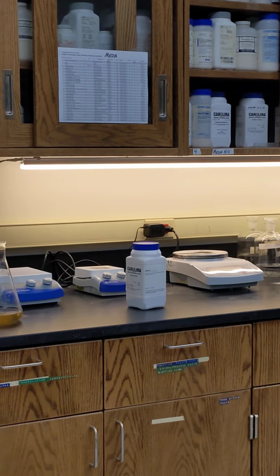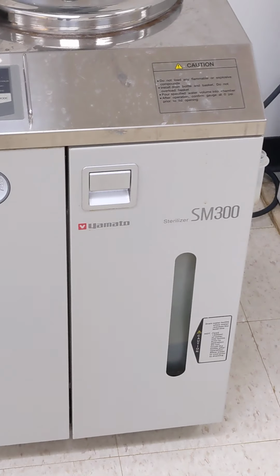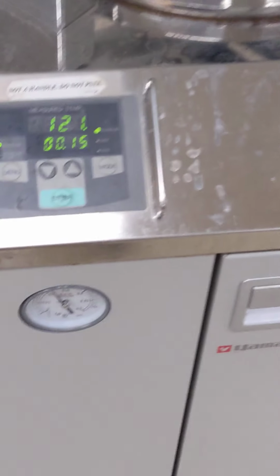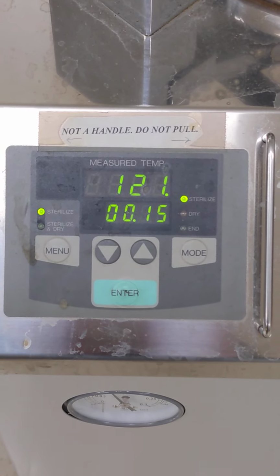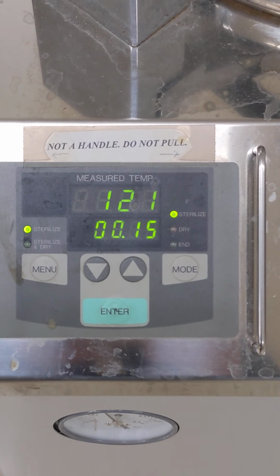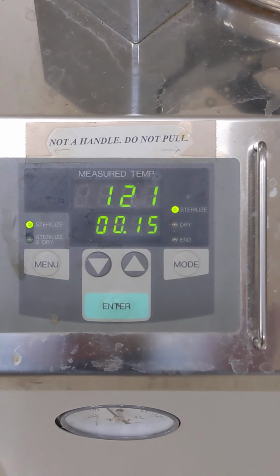So let me just come on over to the autoclave so you can see it. This is our autoclave, the sterilizer SM300. On the autoclave, I set a temperature and the amount of time. Now I've actually set this one for 20 minutes, and it's already done 5 minutes of the sterilizing. So this will sterilize for 15 minutes more, and then it will gradually cool and release the pressure.